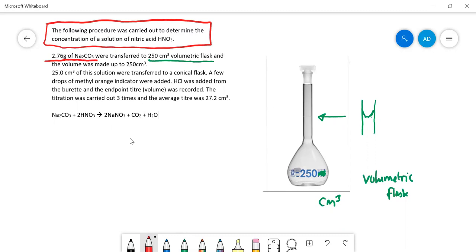What they're doing here is they've got 2.76 grams of sodium carbonate. This is better because in the previous example we transferred a much smaller mass directly into the conical flask, 0.38 grams. You can't measure 0.38 grams terribly accurately because the balance is only accurate to plus or minus 0.01 gram. If you're measuring 2.76 grams, then the percentage error is very small, so you're measuring your mass very accurately.